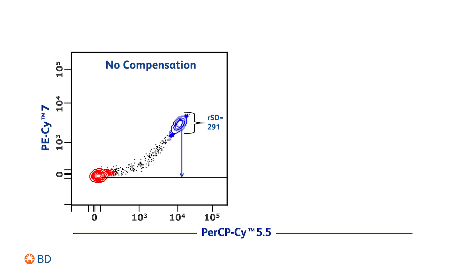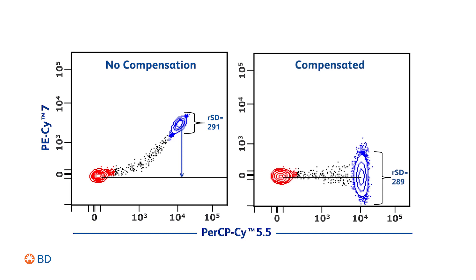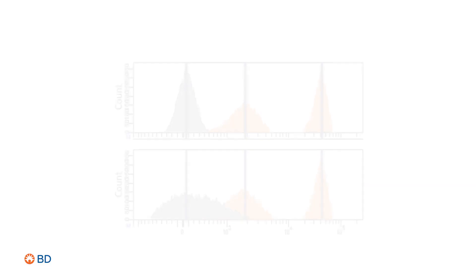To help mitigate these effects, we use the process of compensation, which can eliminate the background. However, the increased spread remains. Spread due to spillover can have significant impact when resolving dim from negative populations, which is critical to good panel design.